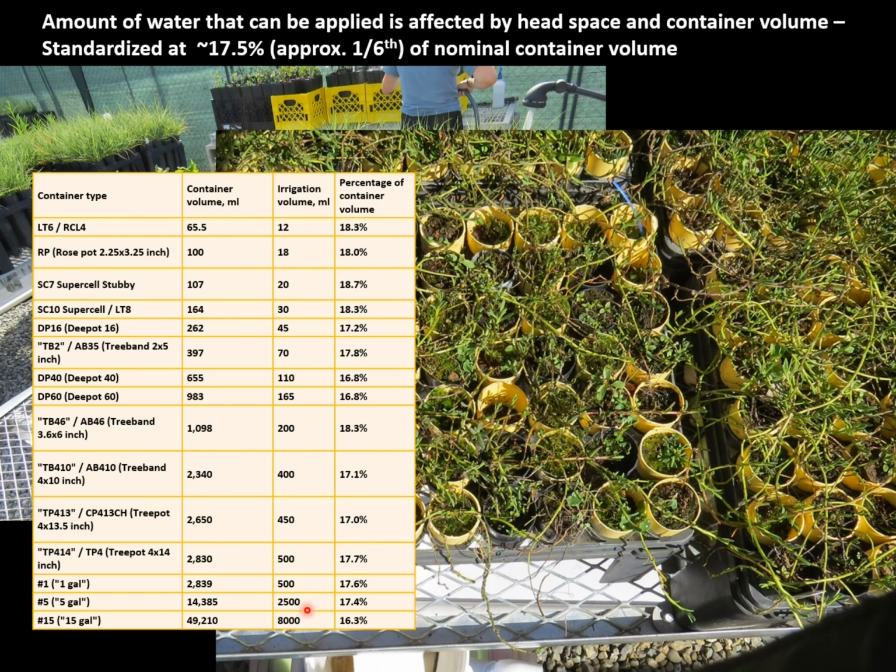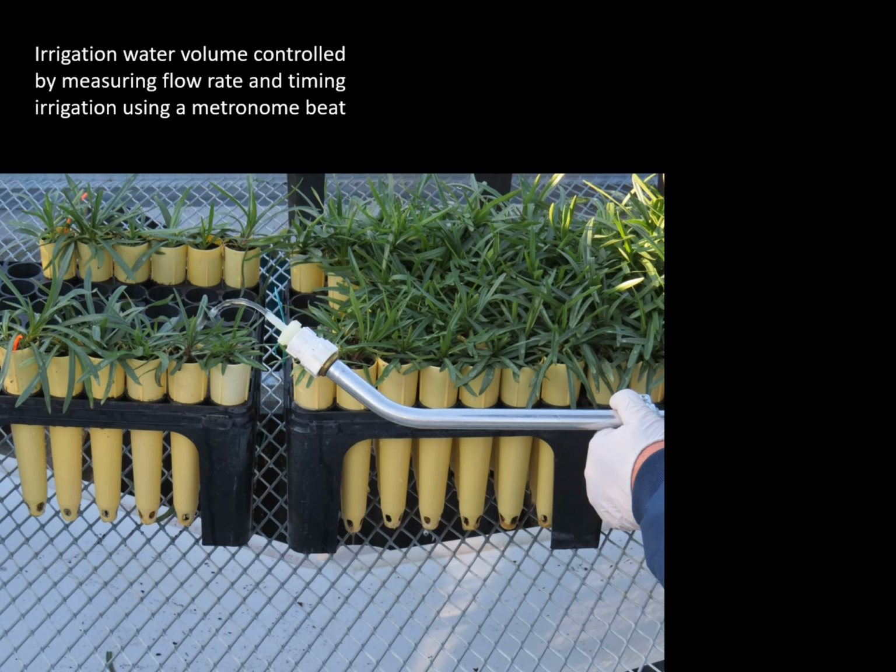We try to round them off so that they're even numbers instead of some odd number that you're not really going to be able to match anyway. So to apply the amount of irrigation water we want to each of many different plants that are being tested in a given test, we want to have some easy way to do this. And the easiest way is to use a known flow rate and then water each plant for the same amount of time. We can do this by measuring the flow rate put out from our irrigation nozzle and then timing it using a metronome beat.